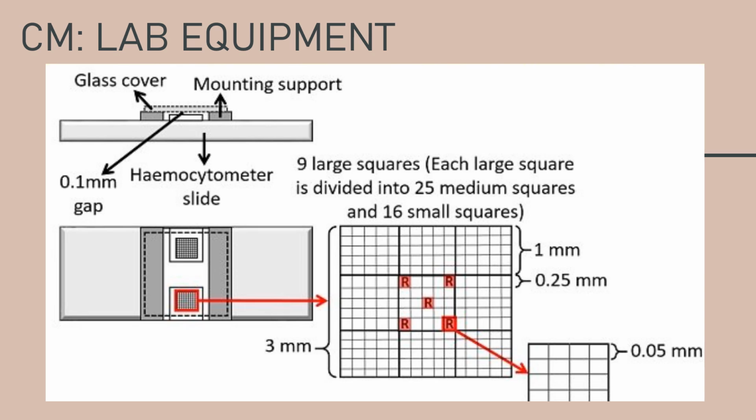Before you use it, inspect that it is clean, and make use of standardized pipettes and fluids that are accurate and designed for your type of cell count. Clean your hemocytometer after every use, using distilled water.